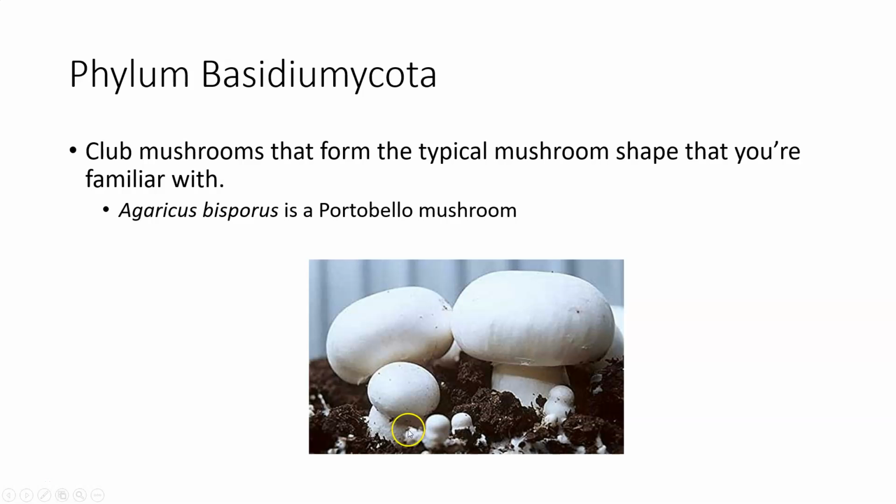There's little clubs that are starting to come up. If you flip it over, it has gills underneath it. But your typical mushroom shape that you have a relationship with, it's in the Basidiomycota grouping, and the club is their reproductive structure. Let's see. So agaricus, that's just portobello mushroom or whatever. It says to look at the mushroom specimens in the lab room and draw what you see in the following space on page 287. Just draw a random mushroomy type thing and you should be good to go for agaricus. They usually just have like a couple of little button mushrooms in a jar.